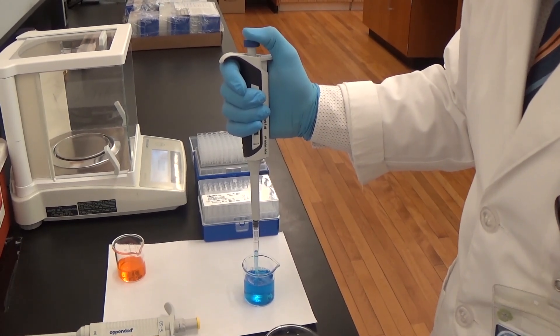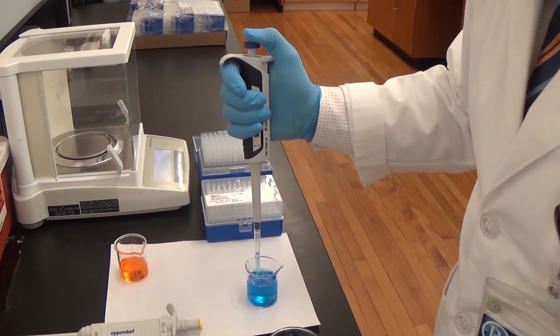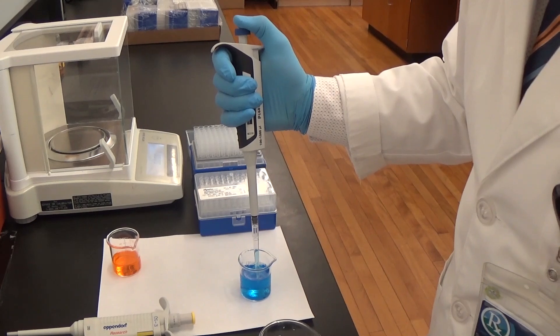Hold the pipetter vertically when drawing and withdraw the tip from the liquid by touching against the edge of the reservoir to remove the excess liquid.